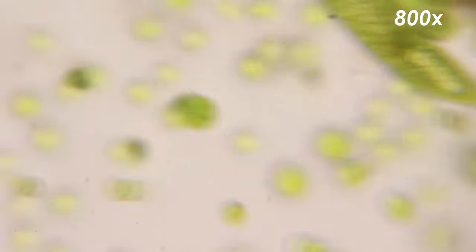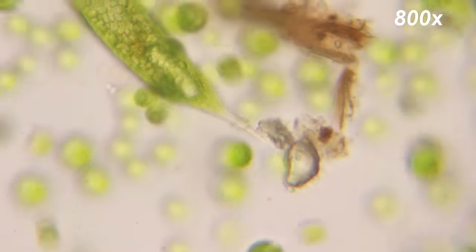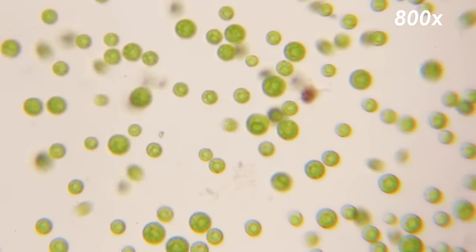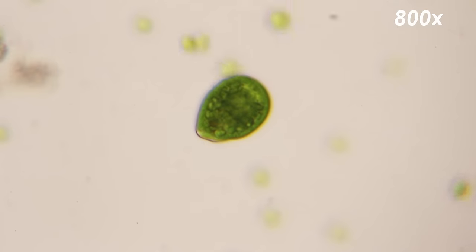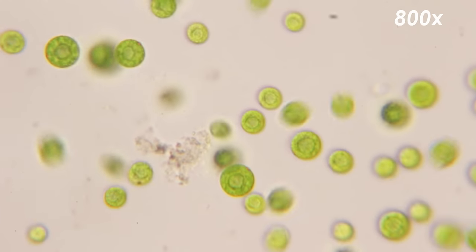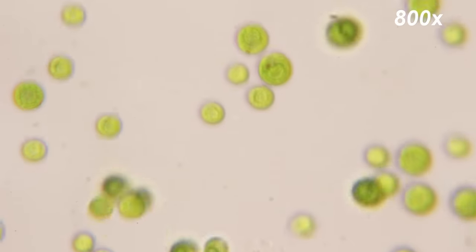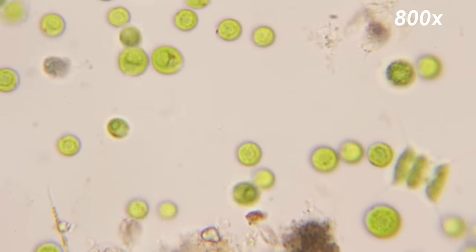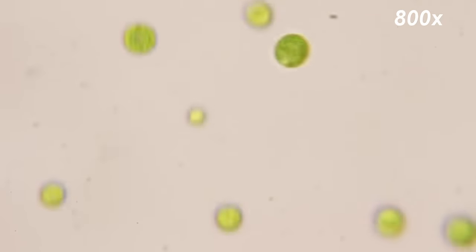This is a Euglena. And so it gives you an idea proportion-wise compared to the size of the Chlamydomonas. And this is at 800 power right here. And here we have a protist just swimming along slowly. And so this gives you a good idea of what the water looks like with all these microorganisms in them.